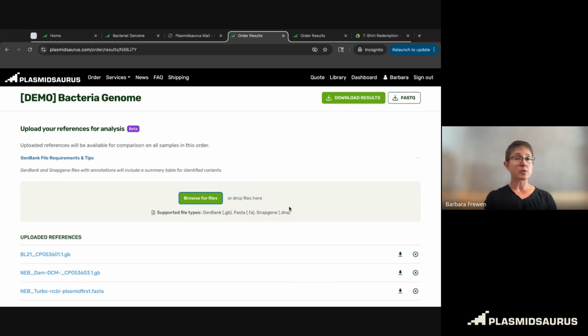But also you may have noticed in that email, it said, "Hello, Matthew." So this is an order that's been shared with me. The feature that's available to anyone. If you place an order and you want your PI, you want your collaborators to have your results, you can share it with them and they can go directly from their account to see it and play with all these features too.